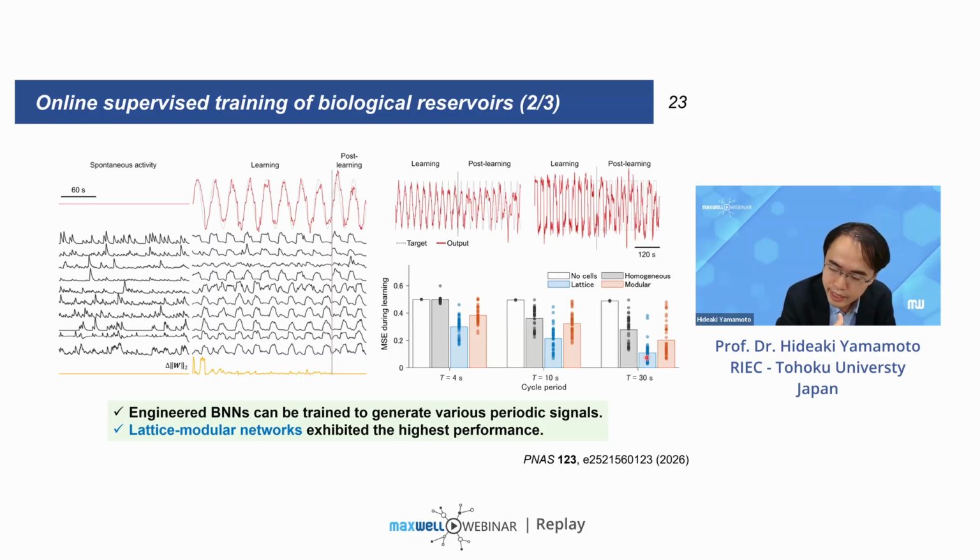We interpreted this as that in the lattice networks they were less synchronous, and the firing rate of the neurons was higher compared to the hierarchically modular networks. Our current understanding is that this desynchronization combined with higher firing rate is helping the higher performance in the tasks that we explored in this paper.